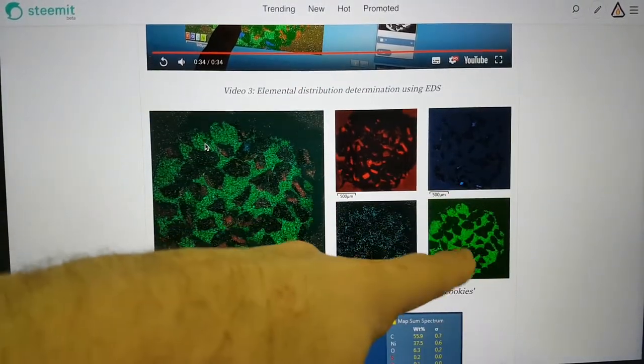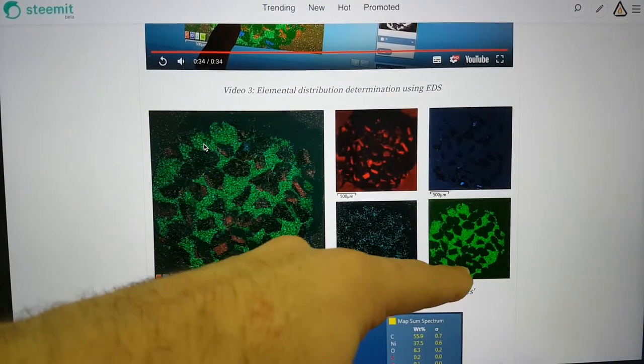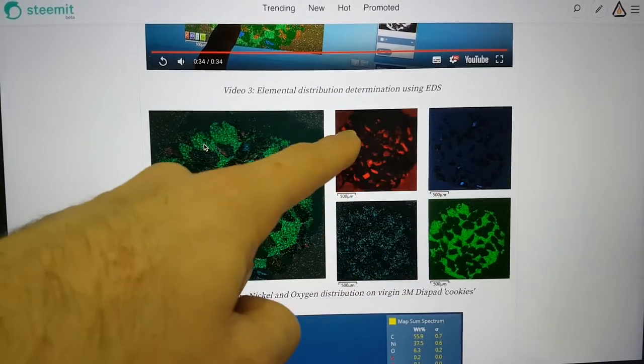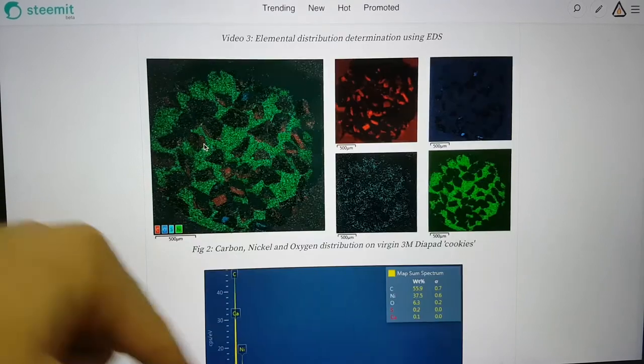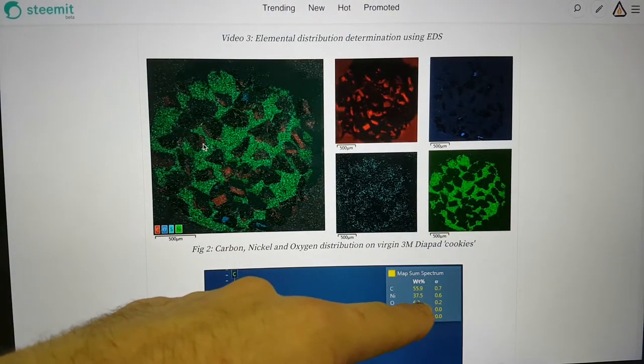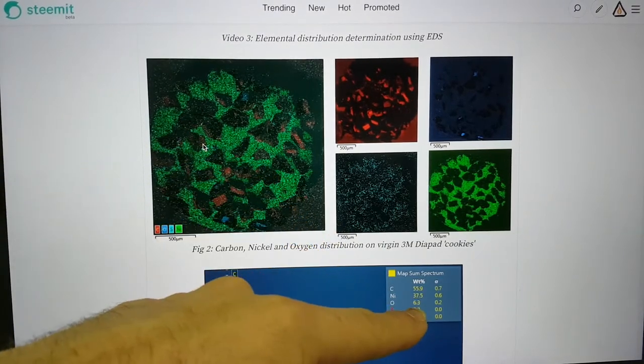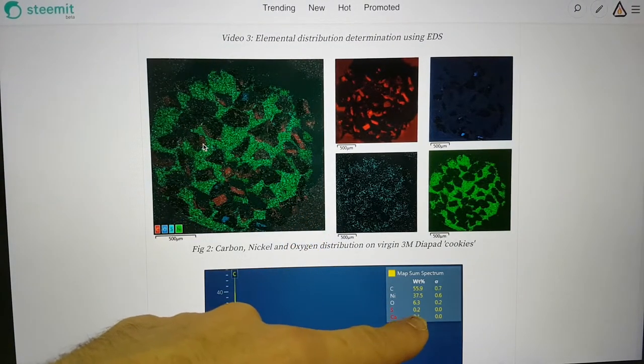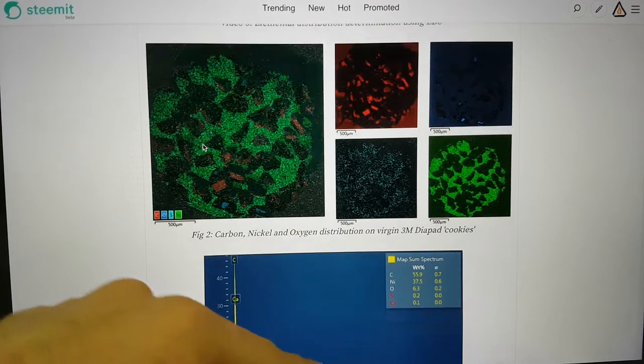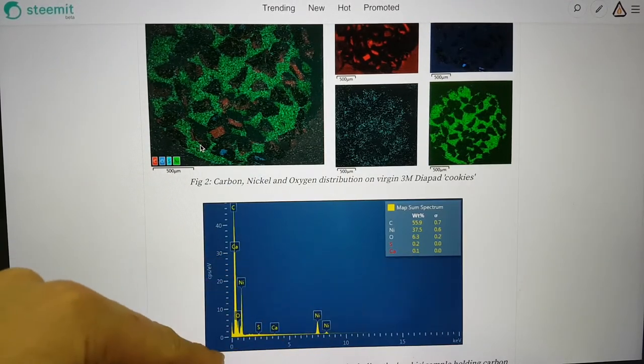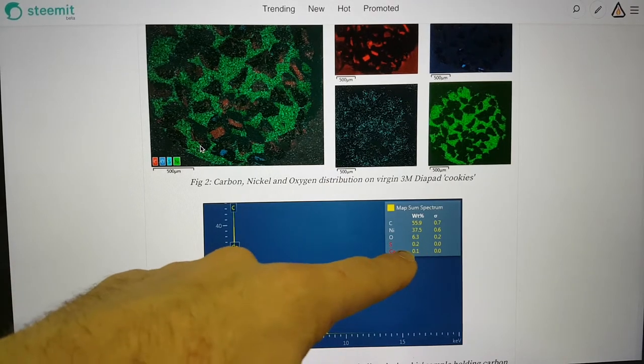You can see the nickel is basically where the bright part of the cookie is and these dark areas here are the carbon. There is some oxygen which may be on the carbon tape or on either carbon or nickel. There also appears to be some sulfur and calcium but they are below the detection ratio for confidence so the SEM marks them as red.